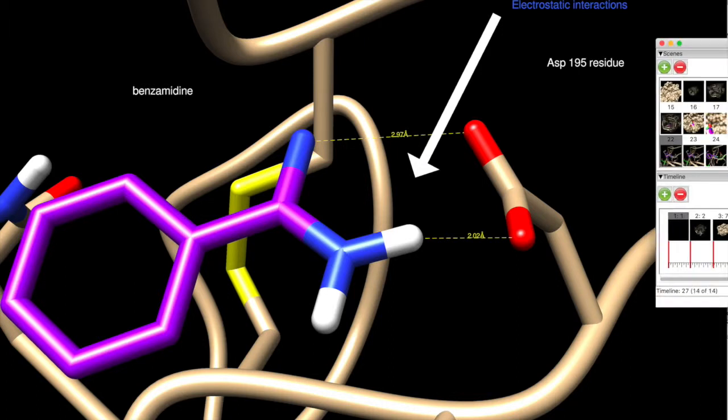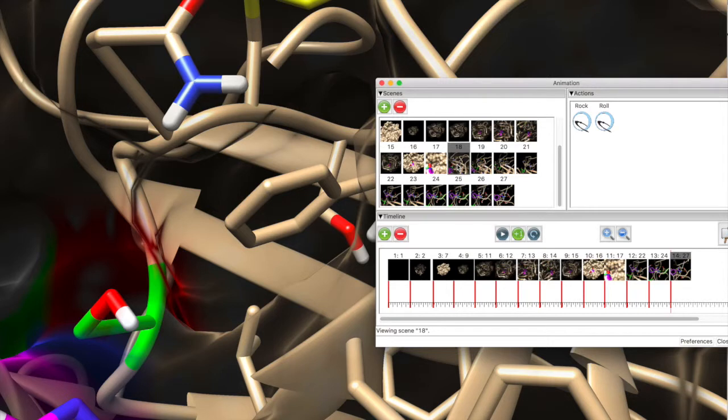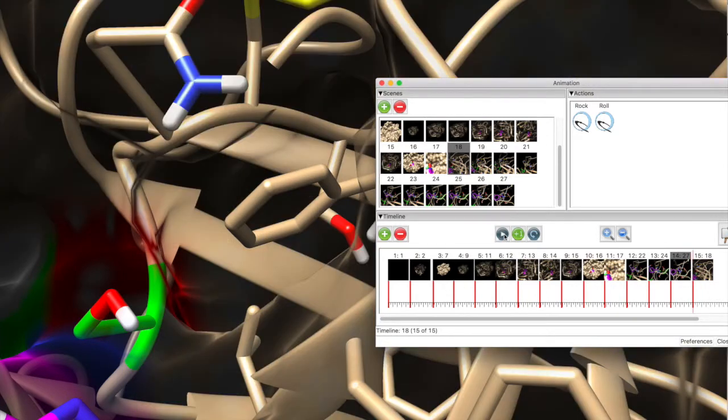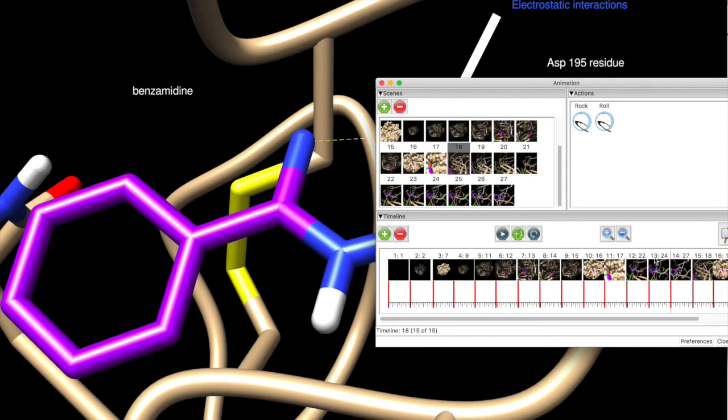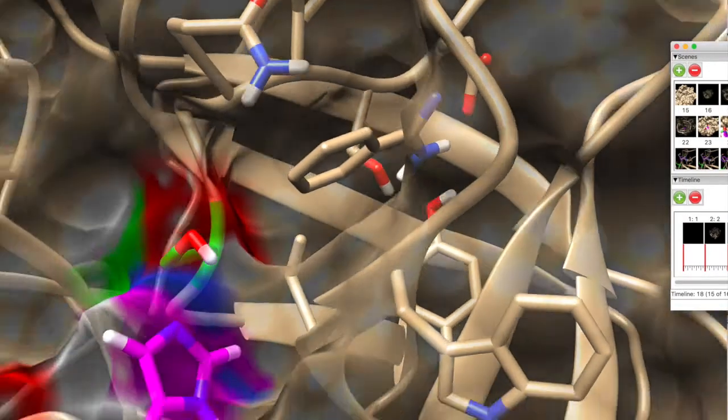Now here is the idea that you can go back and forth and use your scenes multiple times. Let's say I want to go from this scene back to my original scene. I'm just going to drag it here. If I highlight this one and click play, I will transition to the next scene. So I can add another one, and let's see how this looks right now. Very good.